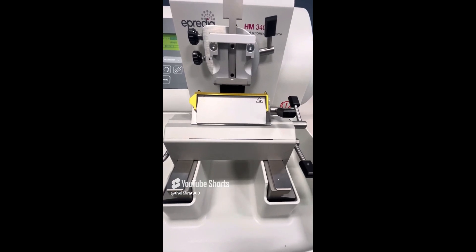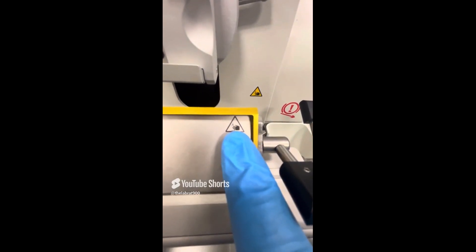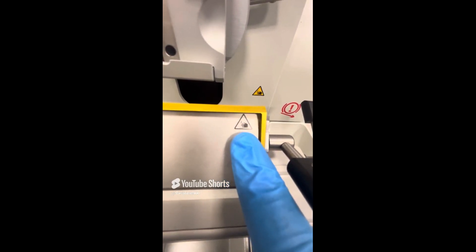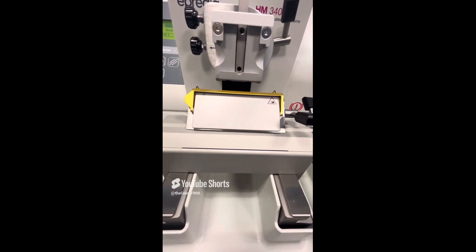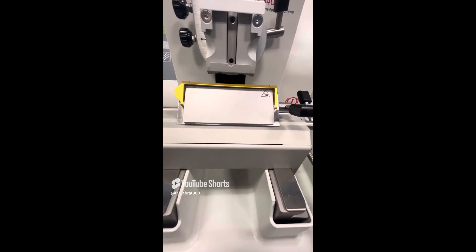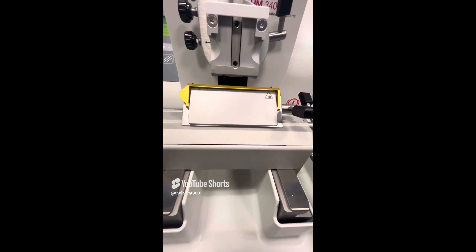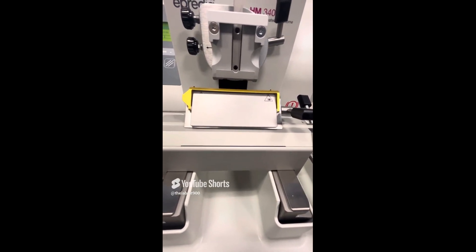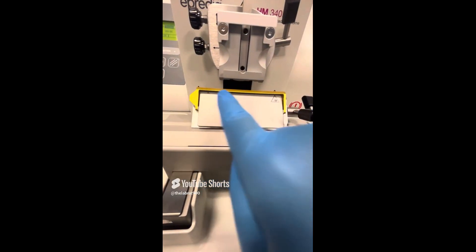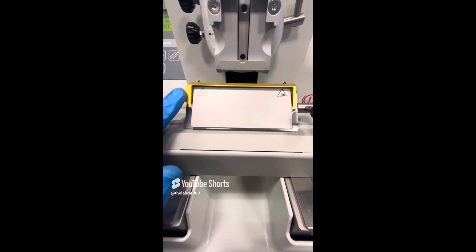Now let's talk about the knife and the blade carrier. If you notice here, there is a warning — it looks like a hand within a triangle shape. The blades we use in this microtome are extremely sharp, and there are a lot of moving parts involved here. This is a danger area, so don't put your fingers in here. Always make sure when you're not using the microtome, you use the knife guard — this gold piece here — which protects your fingers from that knife. Always make sure this is up in place.